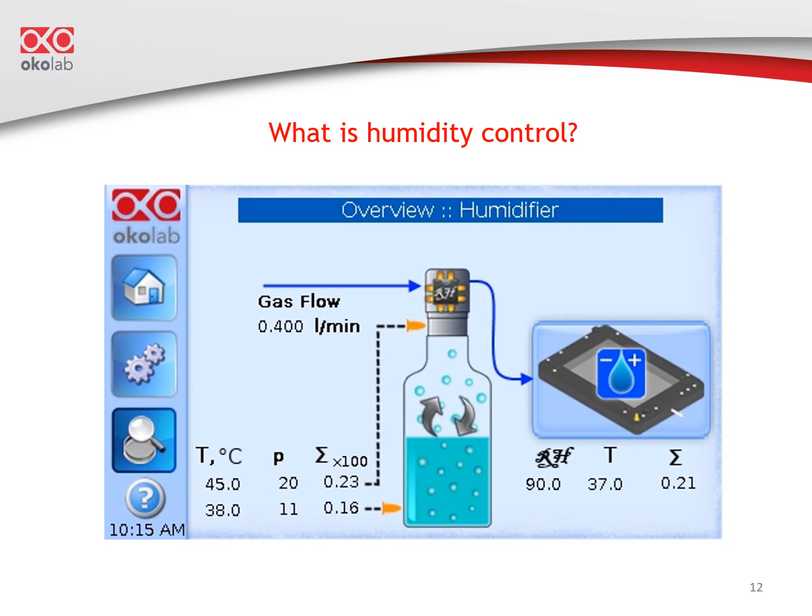This slide shows you the level of control of the active humidity module. In simple terms, to generate water vapor, you have to warm up the water. Hence, the bottle is sitting in a heated base. The vapor phase is above the water, where gas flows and gets humidified. Our in-house tests determined that there's no need for a bubbler. The level of humidity is measured by the humidity sensor lid. The feedback loop automatically adjusts the heating components to reach and maintain the desired set point.